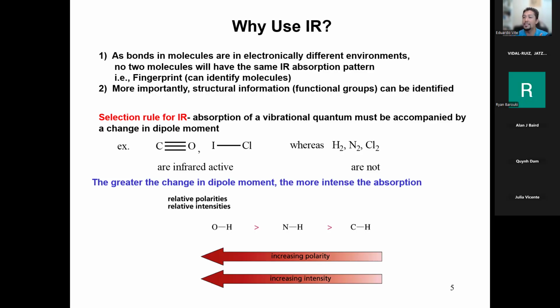The point is resonance. That's what we call that. When you have two energies that are resonating, the energy gets amplified, and that's what we observe as the vibration of the molecule. It just so happens that the vibrations of the molecules have the same energy as the vibrations of an infrared photon. That's why we use IR.